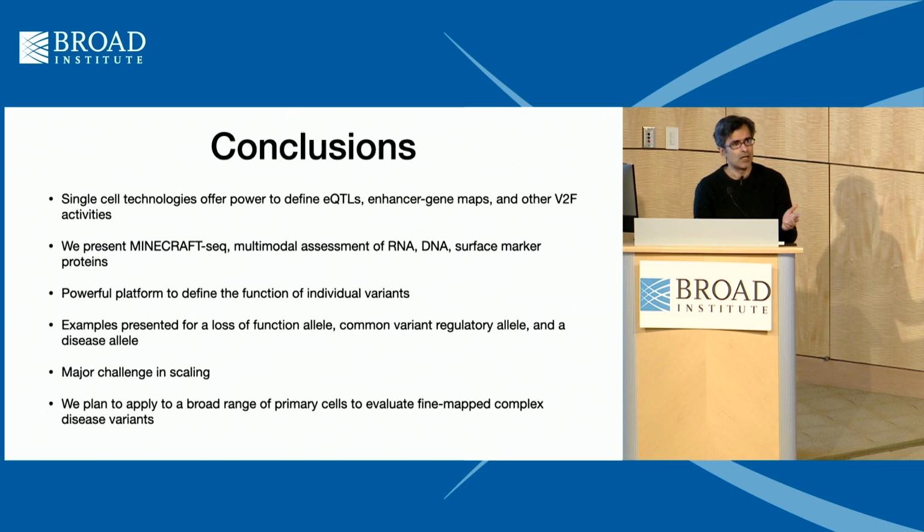We present Minecraft-seq, which is this multimodal or multi-omic assessment of RNA, DNA, and surface marker protein. And it's a powerful platform to look at individual variants. And I presented some examples for loss-of-function alleles, for common variant regulatory alleles, and a disease allele. And the major challenge that we're working hard on is figuring out how to get this to scale.